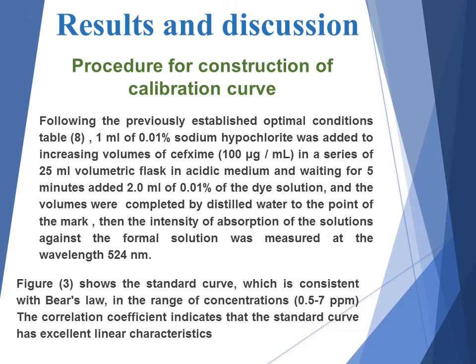Procedure for construction of calibration curve. Following the previously established optimal conditions as shown in table 8, 1 ml of 0.01% sodium hypochlorite was added to increasing volumes of cefixime in a series of 25 ml volumetric flasks in acidic medium, and after waiting for 5 minutes, 2 ml of 0.01% dye solution was added, and the volumes were completed with distilled water to the mark.